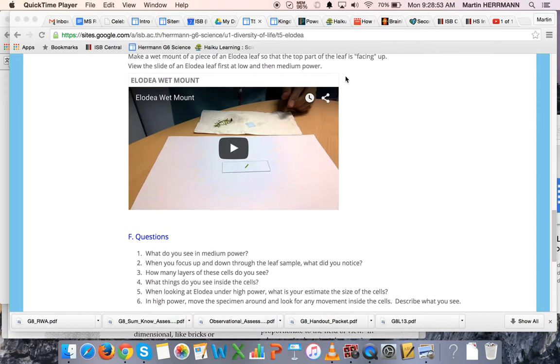At this point you should have the slide of the Elodia leaf on the stage and you should have your microscope plugged in to your MacBook with the USB cable that your teacher had given to you.